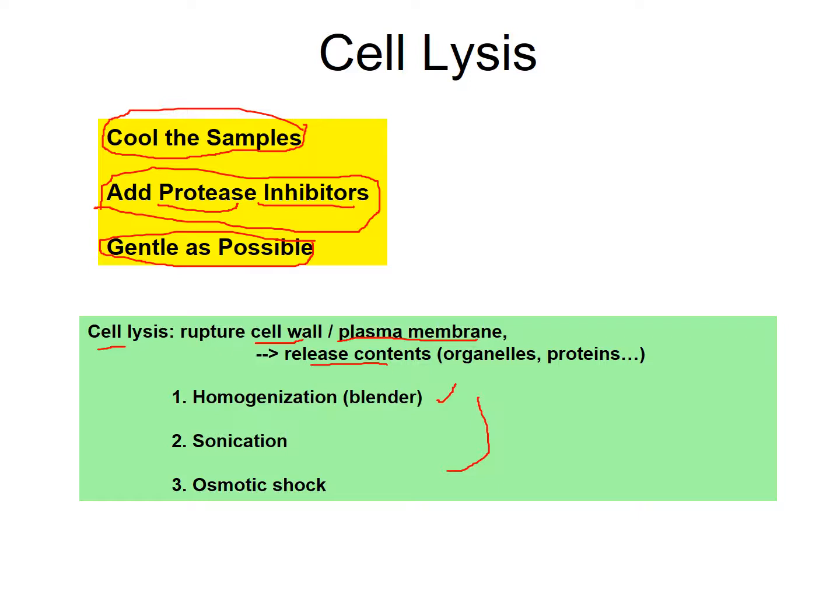You may not know if it's a new cell type or a new condition, new disease cells, nobody's seen it before, it's something new. You may have to try multiple ways and compare the results, right? So that's just letting you know that a lot of these processes, there's not one size fits all. Okay.